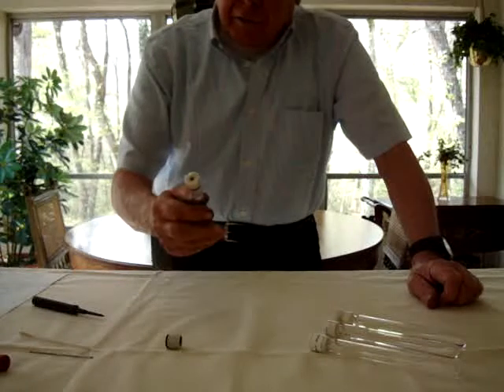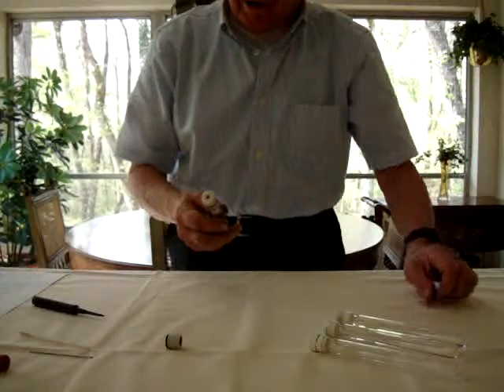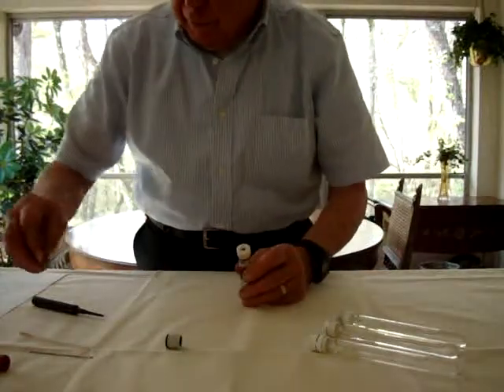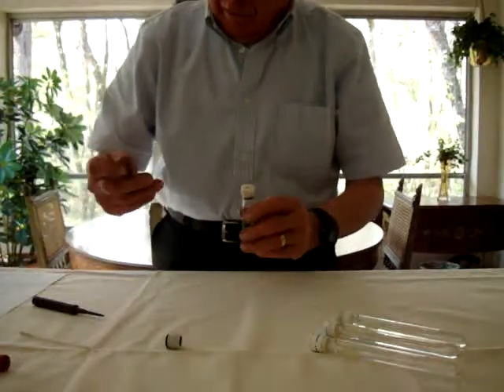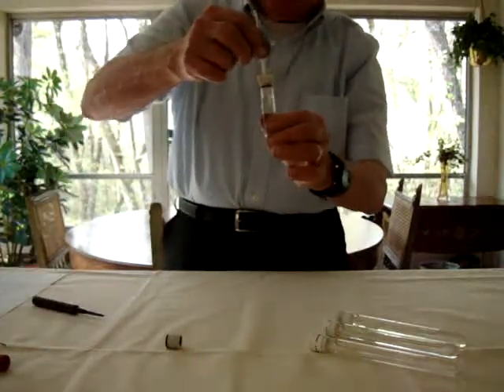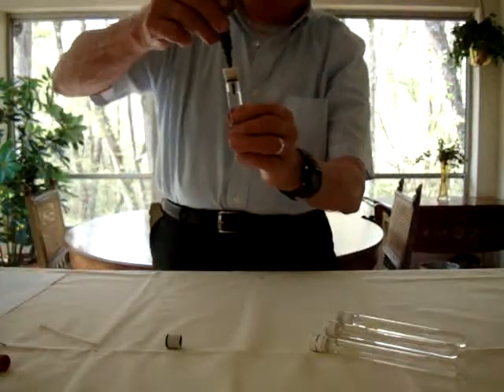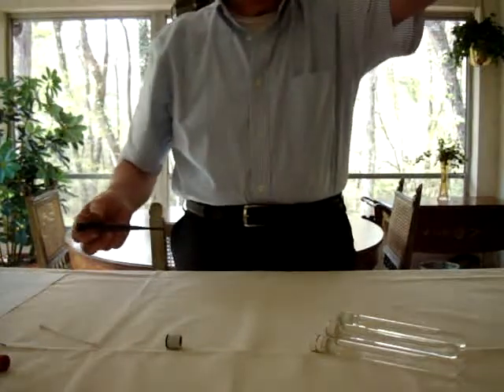The seal that I will demonstrate could just as well be incorporated into an elastomeric stopper. Needles work in this with ease. Bluff probes work in this with ease. Pipette tips work in this with ease — over and over again, without leaking.